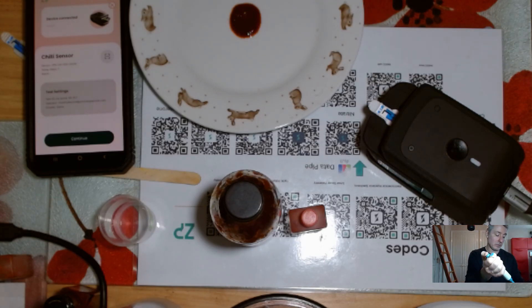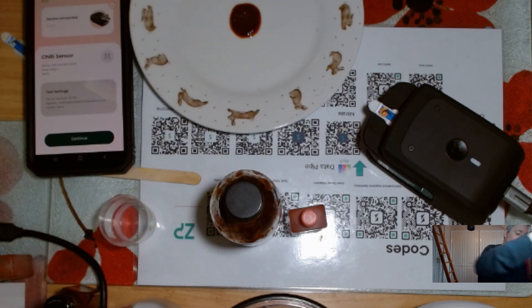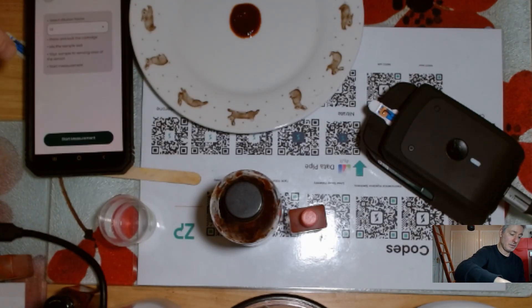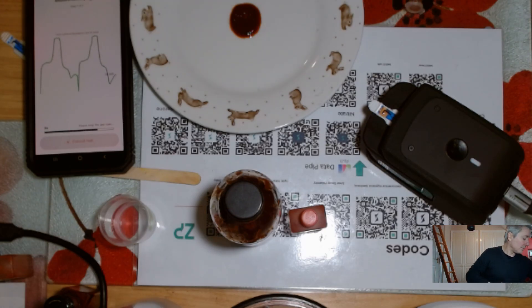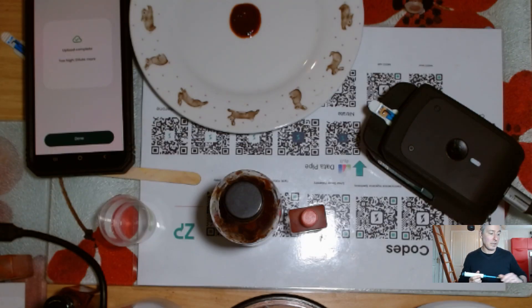I'll grab the sample, put it on there, hit continue, choose one-in-ten, and start the measurement. What you'll notice in a minute is it'll start grabbing the data, and when you see that flat line, that's the first indicator that this sample is too intense and I'll have to do a further dilution. It says 'upload complete' — too high, dilute more. It's sent the data to the cloud.